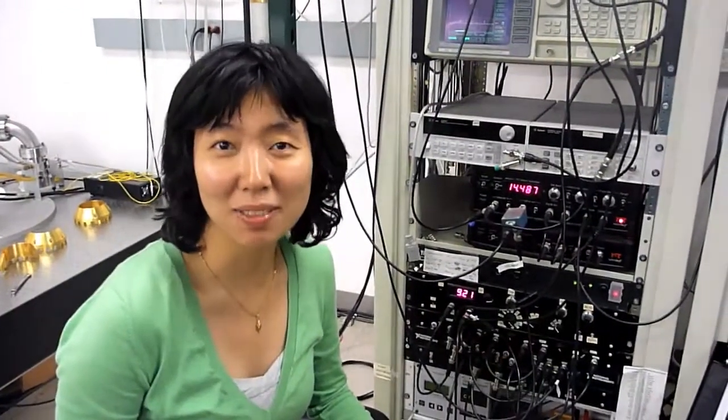Hello, I'm Lan Luan. I'm a graduate student in the EE Department at Stanford, working for Professor Moler in this lab. This lab is actually located in the Geballe Lab of Advanced Materials at Stanford University.